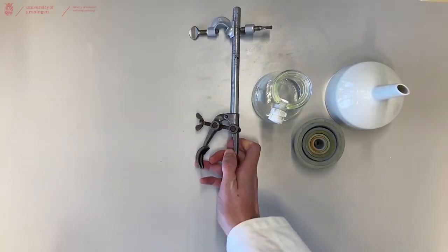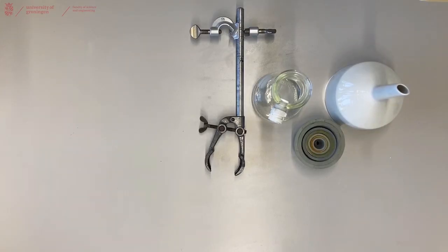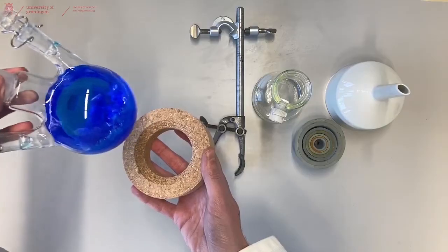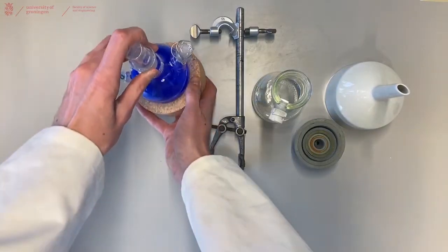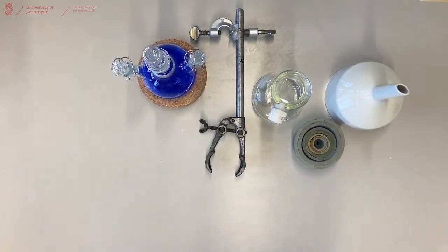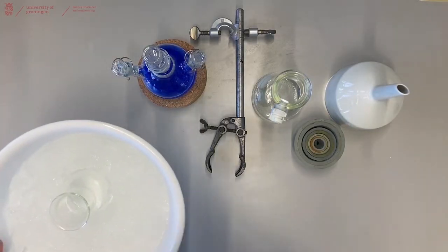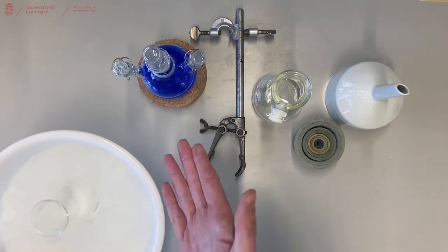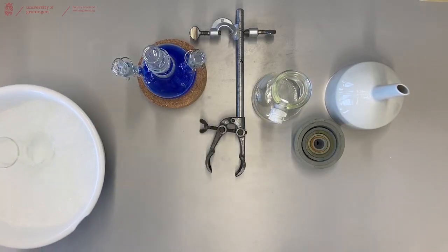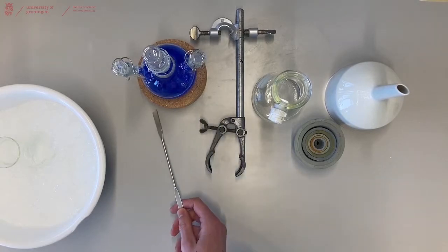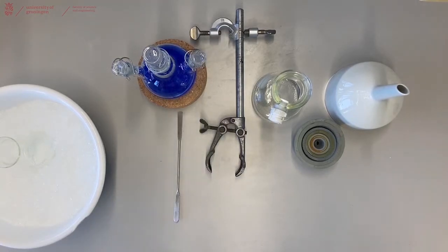Besides that, you will of course need the solids that you want to filter - these are our crystals from the recrystallization video. Generally you need to wash your crystals using a cold solvent that's the same as the solvent used during your crystallization. It's always handy to have a spatula at hand if you need it to get the solids out of your flask.